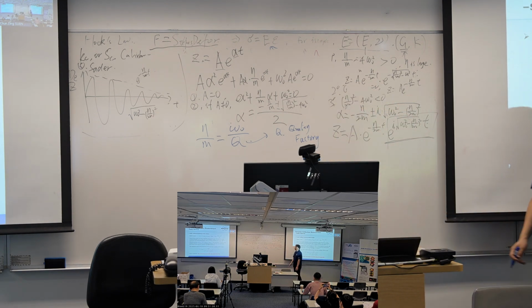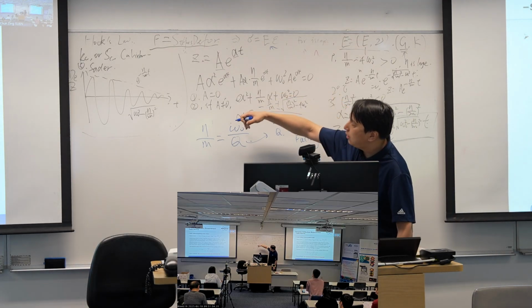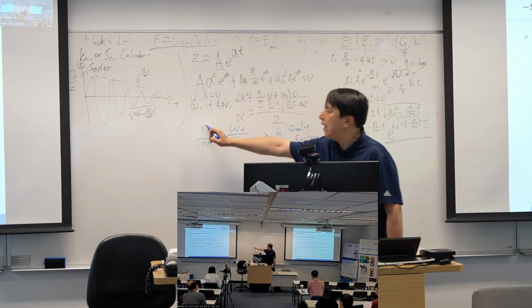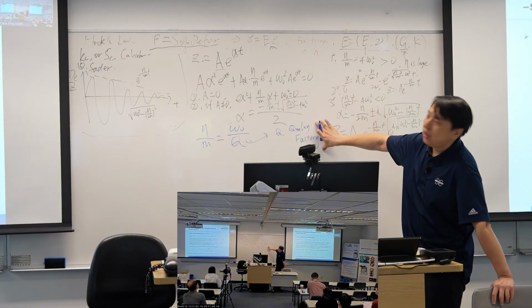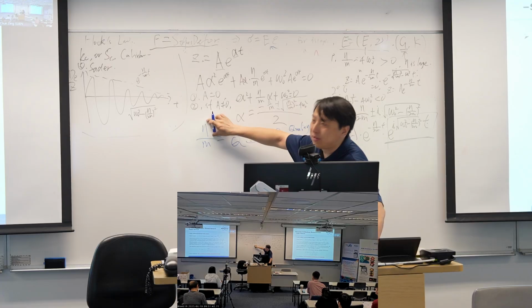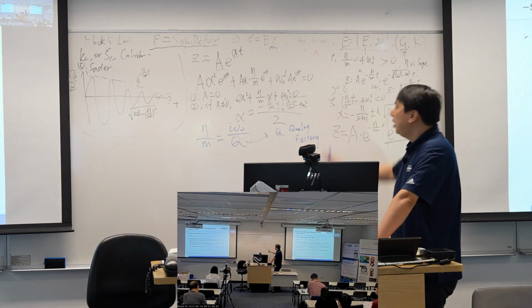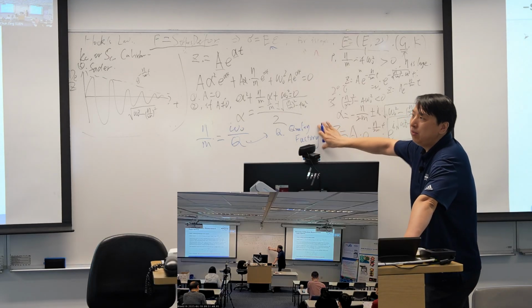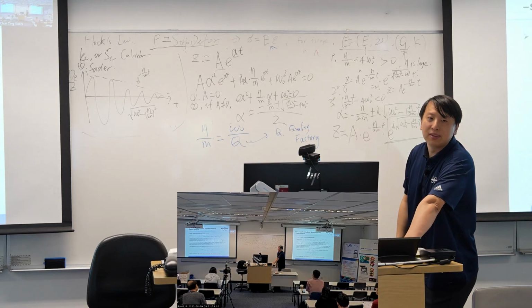It is used to describe the relationship between the resonance frequency and your hydrodynamic force. If the Q is large, it means your hydrodynamic force, or the eta, or the viscosity is quite low. If the Q is small, you are facing a large hydrodynamic force. That's our idea.